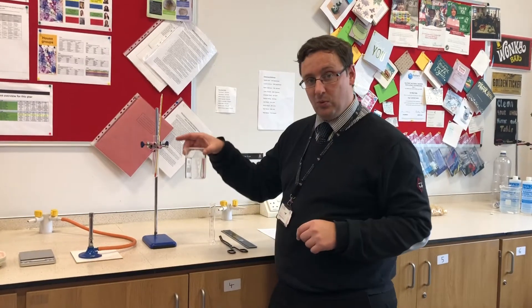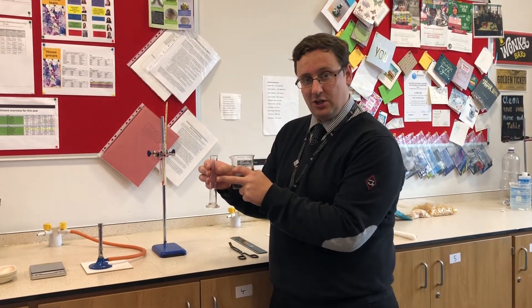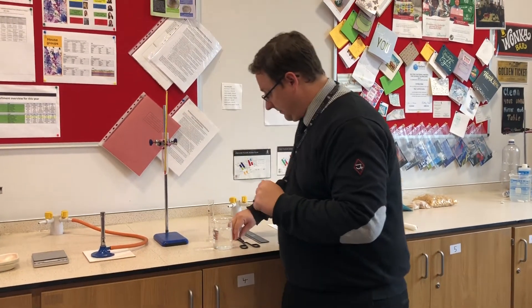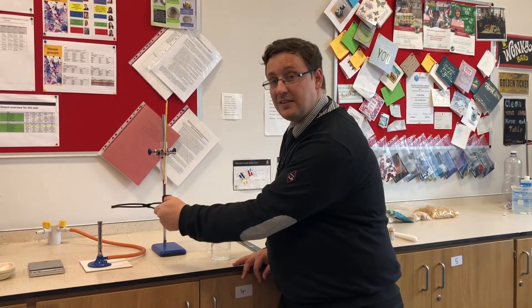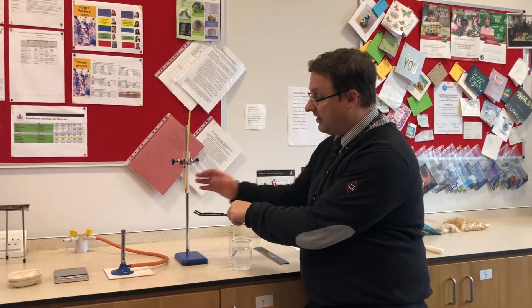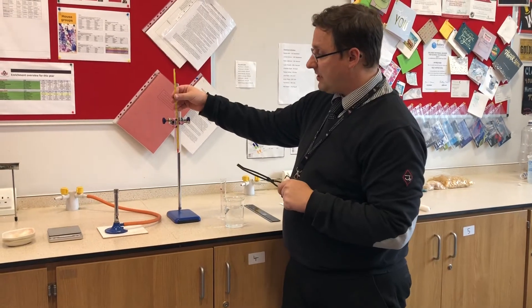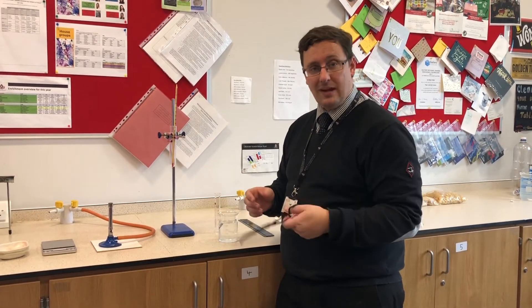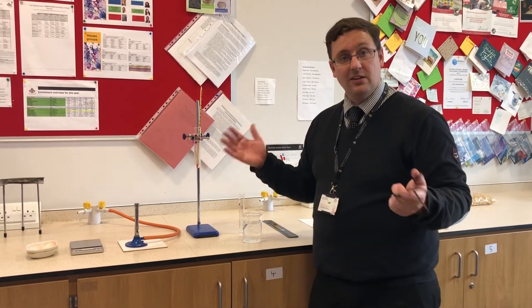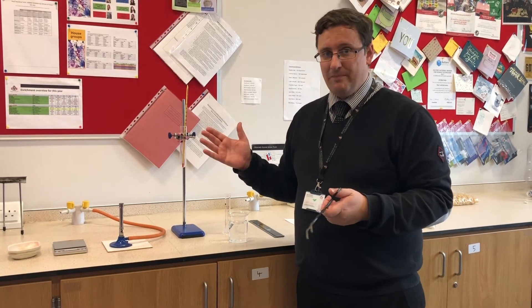We've got an experiment over here and this is how we're going to do it. I'm going to get some water and put it into a measuring cylinder up to the mark where it says 20 - that's 20 millilitres or 20 centimetres cubed. I'll put this water in the boiling tube, then take a measurement of the temperature with my thermometer. After that I'm going to take my tongs, get some food, and burn it using the Bunsen burner. As soon as it's on fire I'll put it underneath here and the heat released will cause the water to increase in temperature. I'll wait until the whole thing has burnt up, then take another measurement with my thermometer and work out the change in temperature. If the water goes up by a lot, that means a lot of energy has been released - the food contained a lot of energy. If the temperature only goes up by a tiny amount, that means that food contained a little bit of energy.